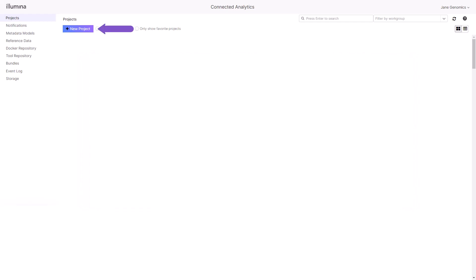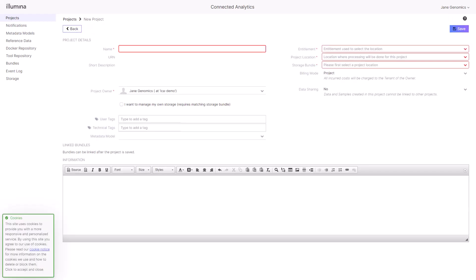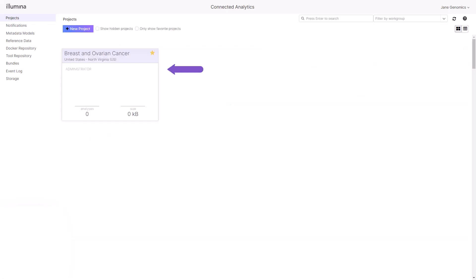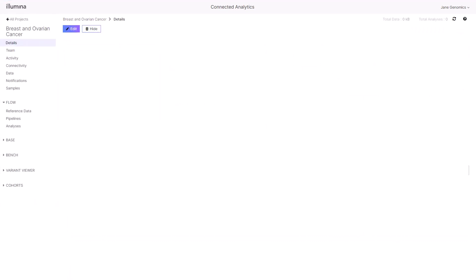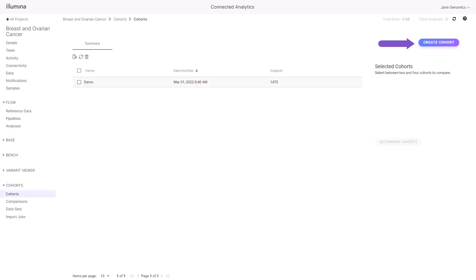We begin by creating a new project in Connected Analytics Core. Enter a logical project name, like Breast and Ovarian Cancer, then select Save. Select the newly created project, navigate to Cohorts from the navigation pane, and select Create Cohort.